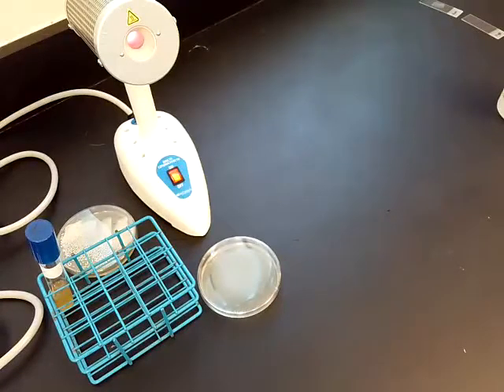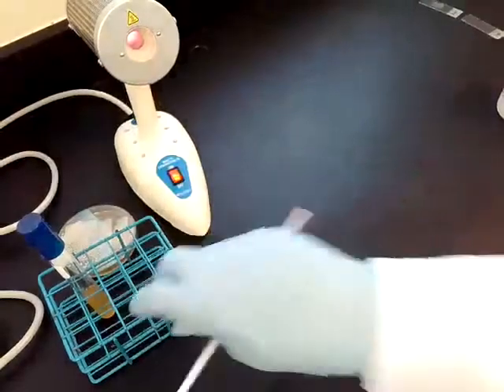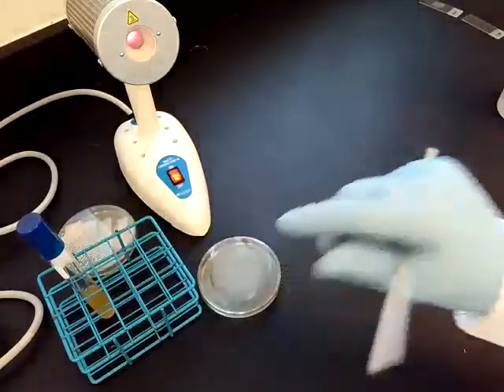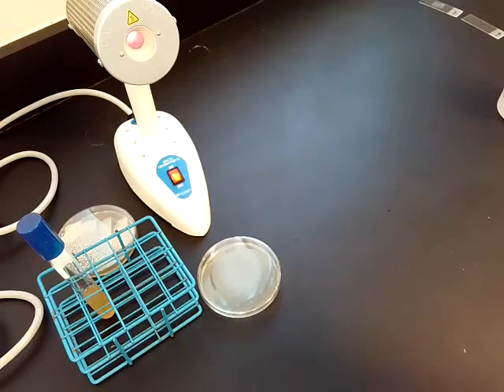So let's pretend that we just swabbed a patient's wound, and in that sample we see a whole bunch of different types of cells and all different types of bacterial cells mixed together. We take that patient's swab, we'll slosh it around in a tube, it gets really cloudy, and now we can take this broth and we can smear it on the plate thinner and thinner and thinner until we isolate colonies. A colony is an individual separated growth of bacteria.